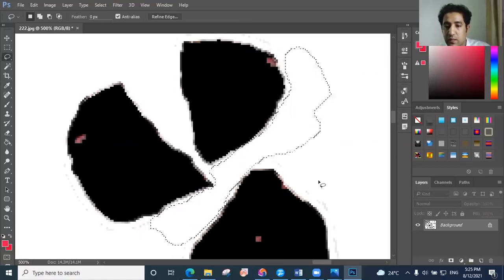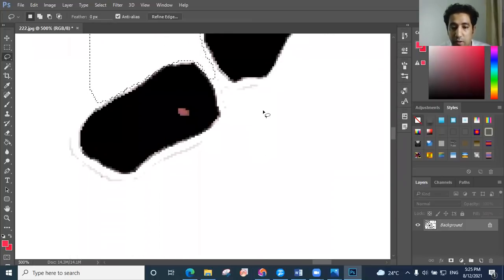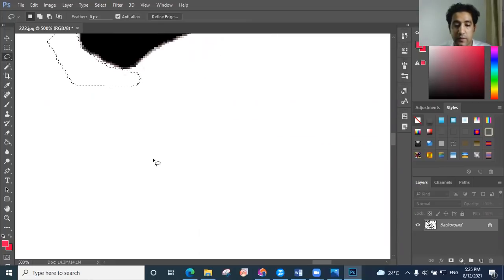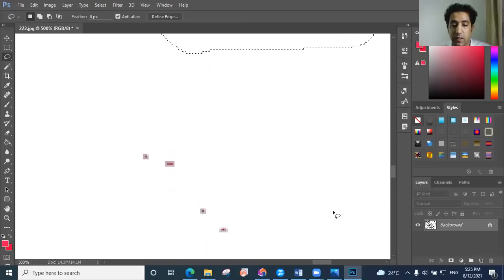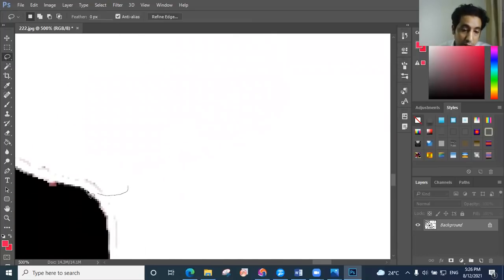All right, just keep going and move on. Here's some here. Circle and delete. Okay. Circle on here. Make a big circle and make sure it's in an empty place, or here.